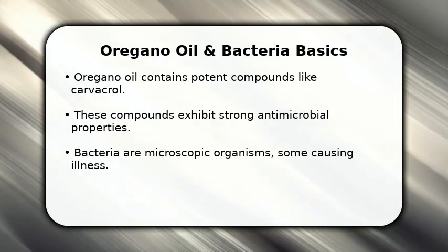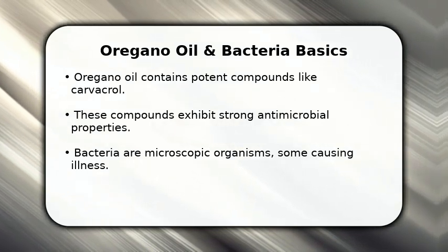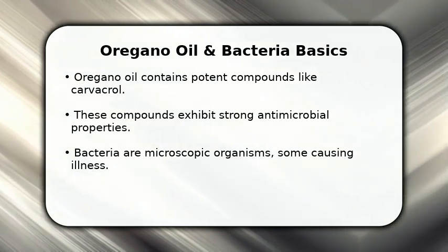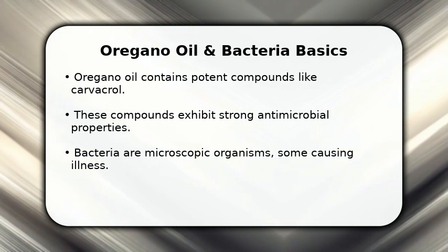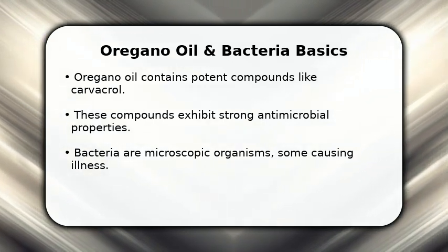In this video, I will compare oregano oil versus bacteria. We will explore the active components in oregano oil and understand how they interact with bacterial cells. You'll learn about the microscopic world of bacteria and see how oregano oil's effects can be observed. This comparison will highlight the oil's potential as an antibacterial agent.